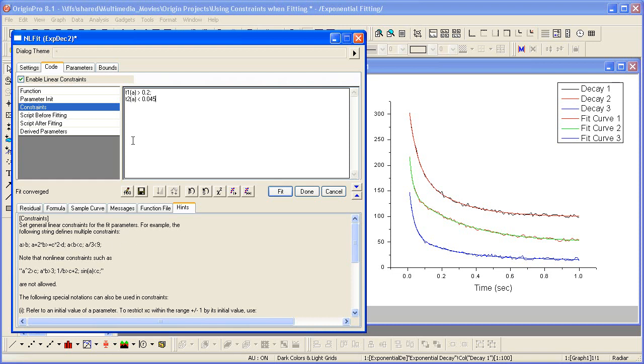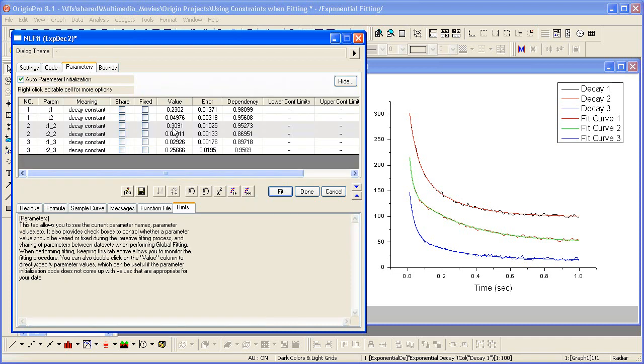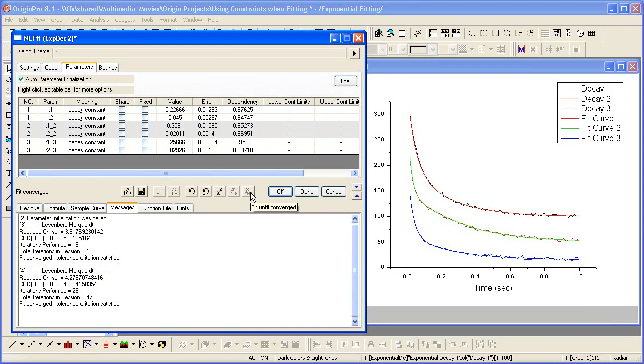Now I go back to parameters. Notice that this Fit Until Converged button is enabled again. We'll go back to parameters so we can watch these change when we do the fit, and they should use the constraints that we entered.